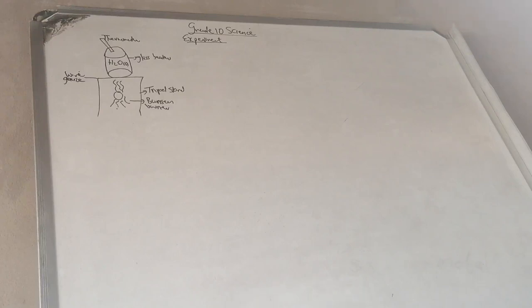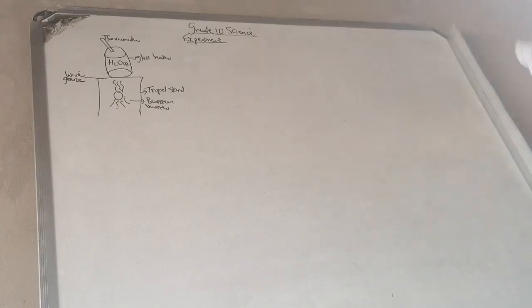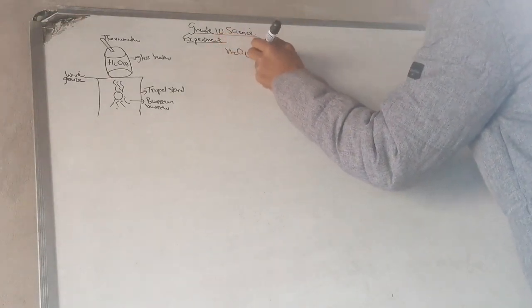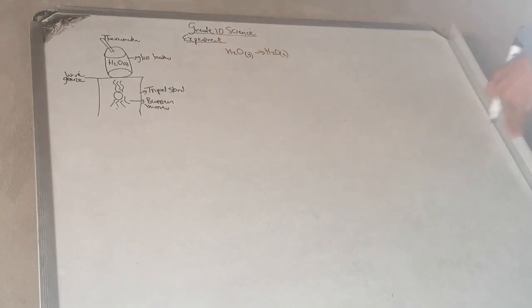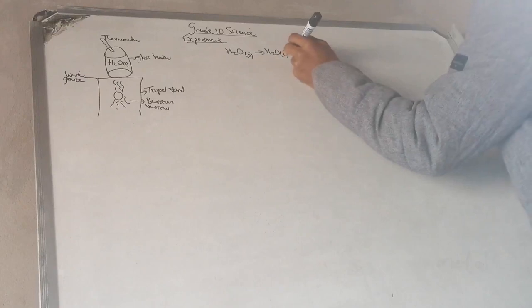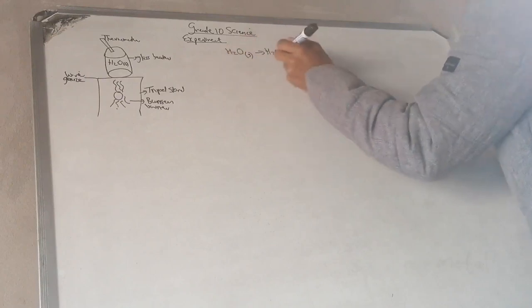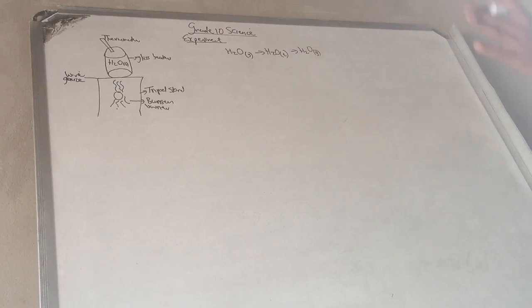Make the observations of the change in phases. As we keep on stirring, you must identify that H2O as a solid will first change to H2O as a liquid. Then, as you keep on stirring gently and make your recordings every 5 minutes, you will reach a state where H2O changes phase from liquid to a gas. And we know that the temperature there must be 100 degrees Celsius, because that's when water boils.